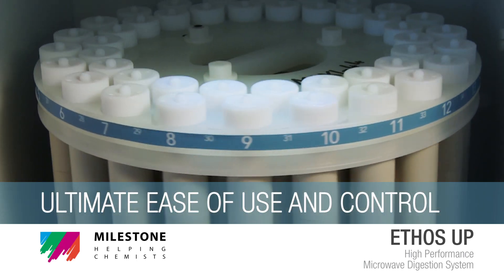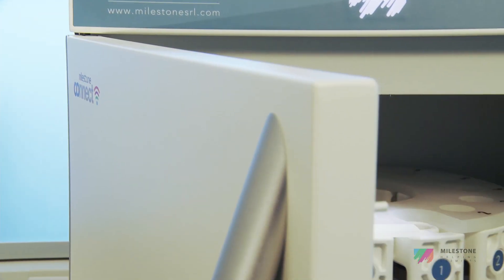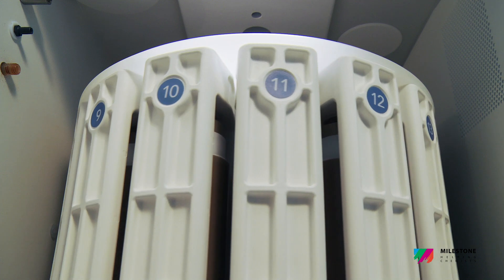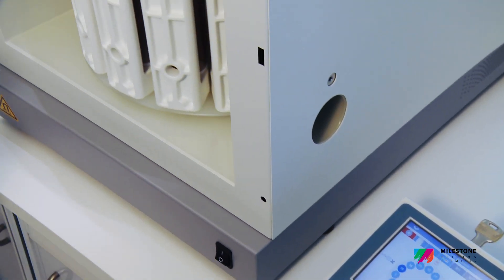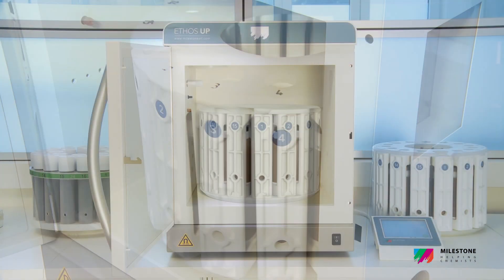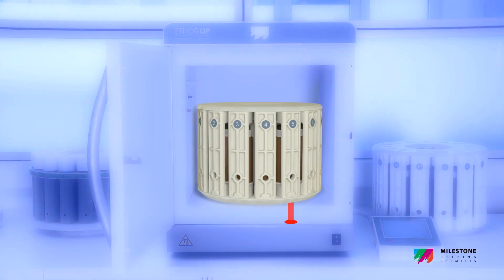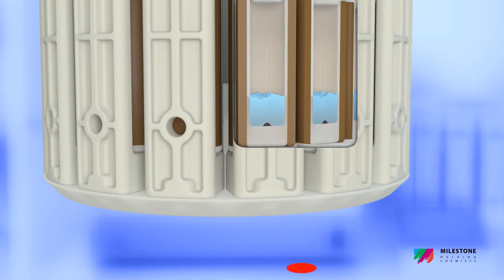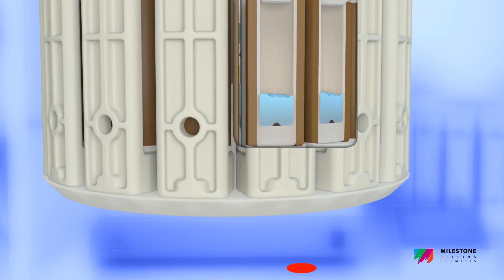Ultimate Ease of Use and Control. Temperature is the most important parameter in a digestion process, as it controls the reaction and determines digestion quality. Milestone's EZ-Temp contactless sensor directly controls the temperature of all samples, providing accurate temperature feedback to ensure both the complete digestion in all vessels and a high level of safety.